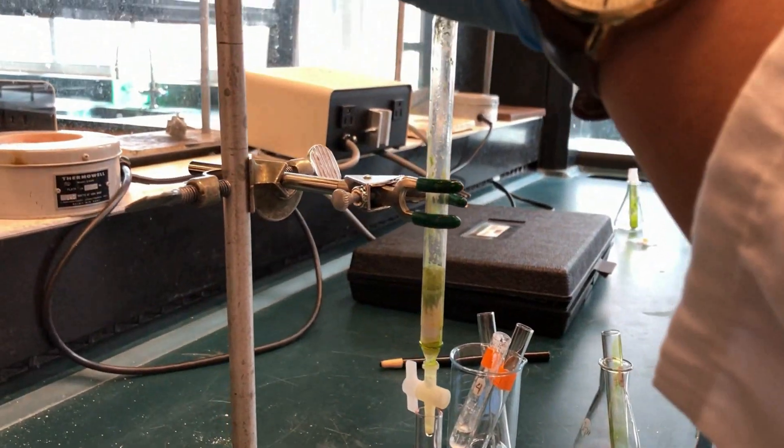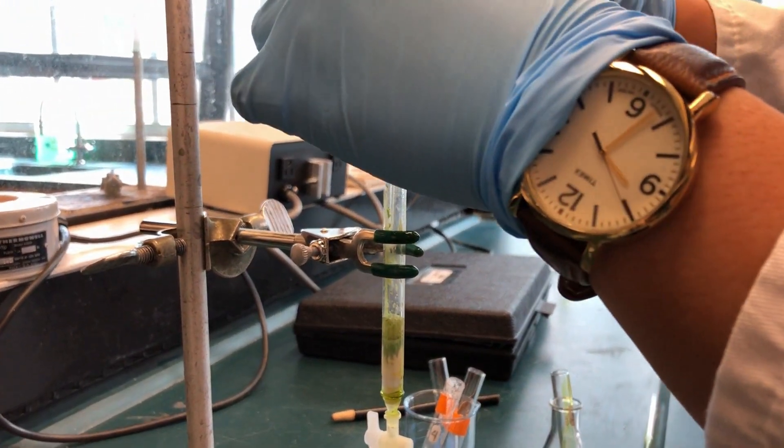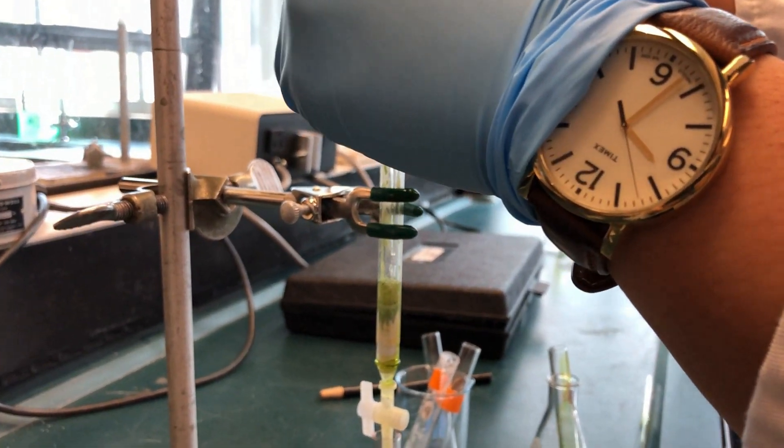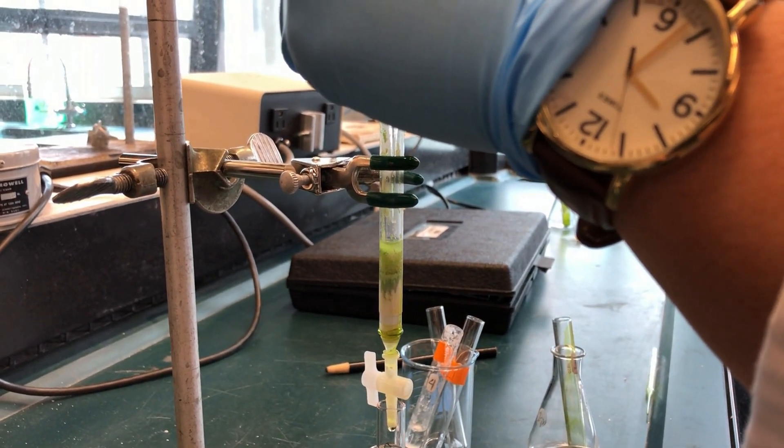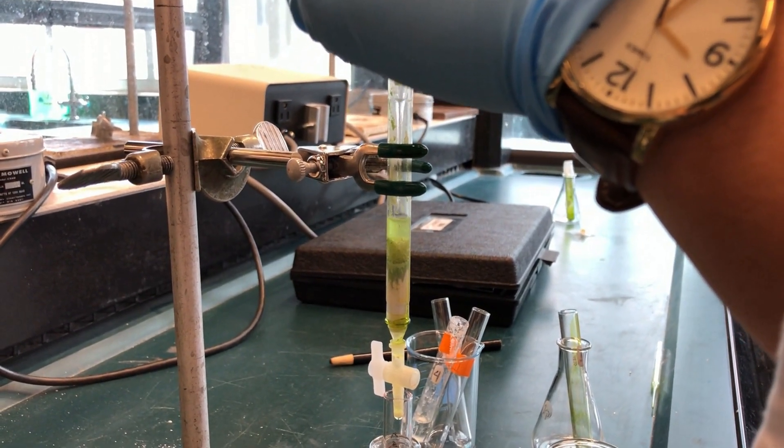If the yellow band does not separate from the green band, then change to a more polar solvent such as the 70-30 petroleum ether until the yellow band passes through the column.